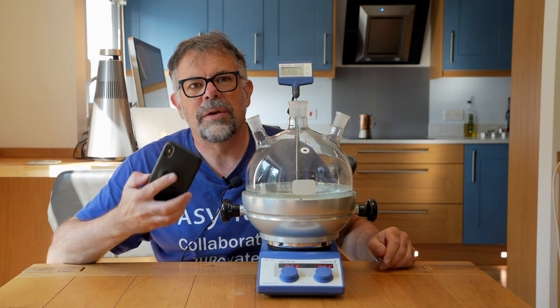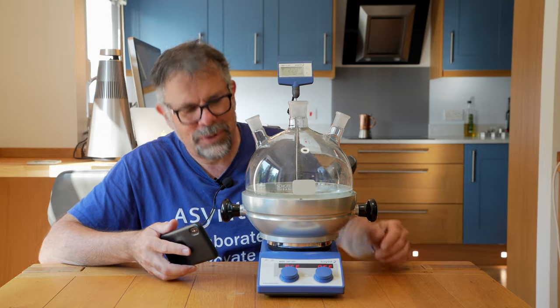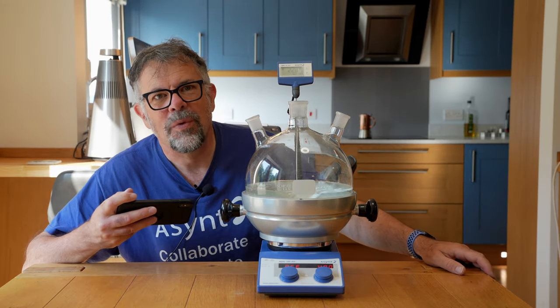Now I'm going to video its incredible magnetic stirring performance with some music.